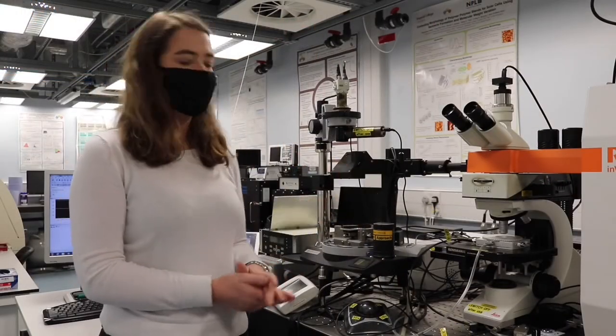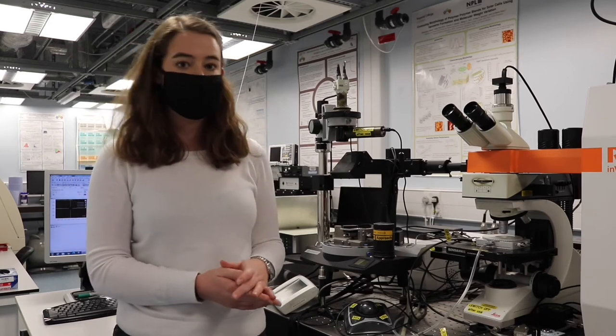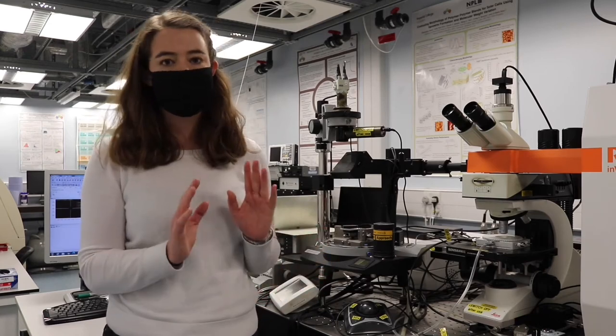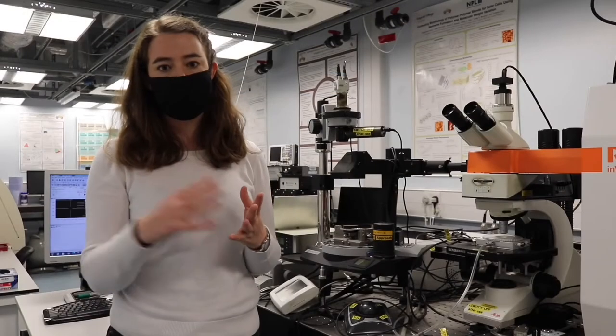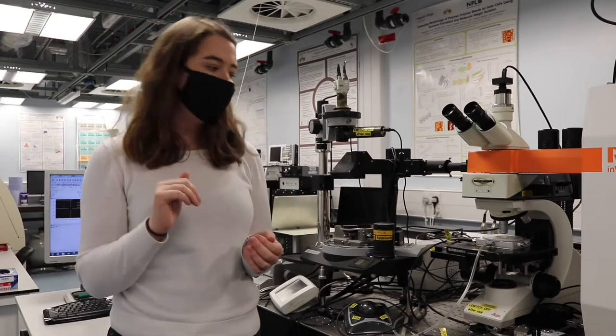This is a Raman spectrometer. We use this to measure the molecular vibrations of polymers and small molecules. It can tell us lots of information about what's happening right down on the nano scale and how the polymers are packing together or how they are interacting with other layers in our devices.